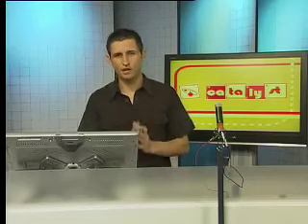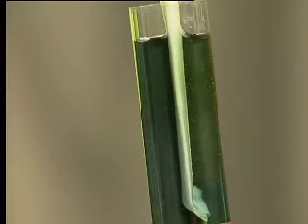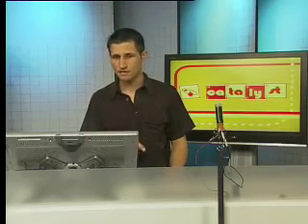I'm taking a little bit of a closer look at one of the chloralkali cells. The one that I'm focusing my specific experiment on this evening is the asbestos cell. This is no longer in use, but one of the things I wanted to show you was that we can actually physically see the three products being made. Let's just remind ourselves what that cell entails.